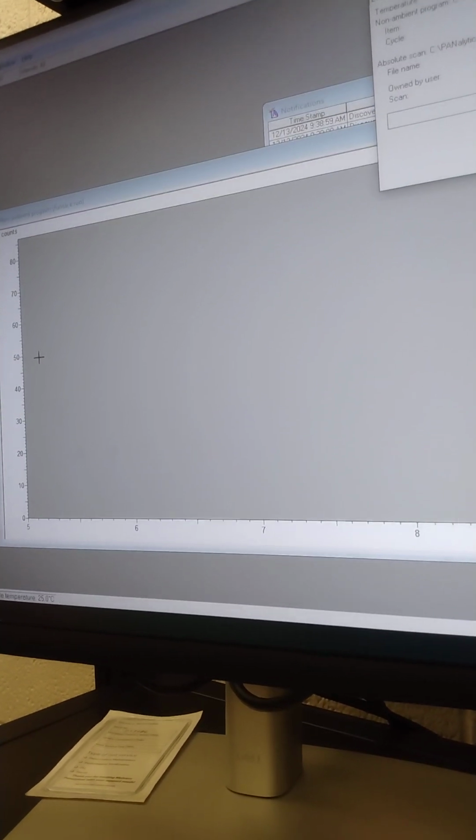For the system, now it's moving the detector. Is it preparing? And is it heating? No, it's going to do a scan at room temperature first. What we did programming-wise is complete. Yes. I'm going to stop this video. Have fun, everybody.